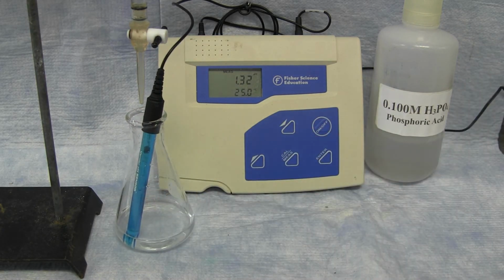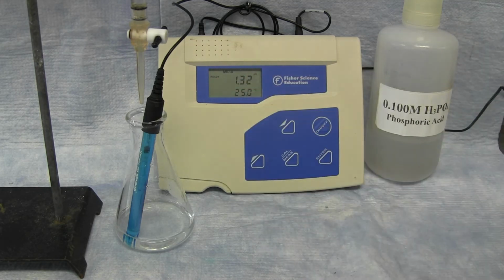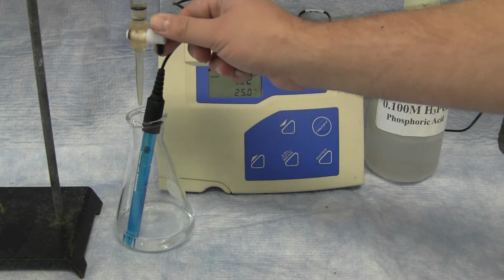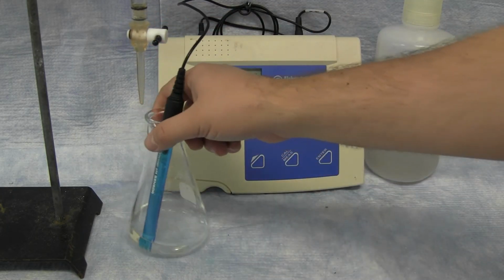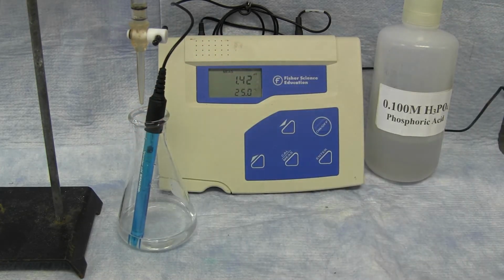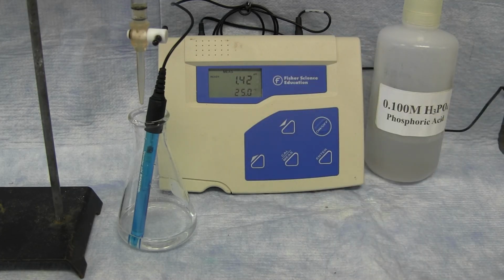And record the pH again. Once the indicator says ready, you can move on to the next titration, or the next addition. You will add again 1 milliliter of sodium hydroxide, swirl the flask, wait for the measurement to stabilize, and record the pH reading.